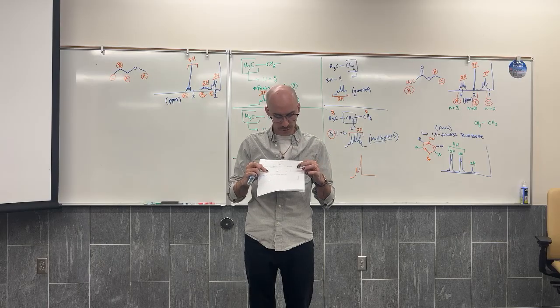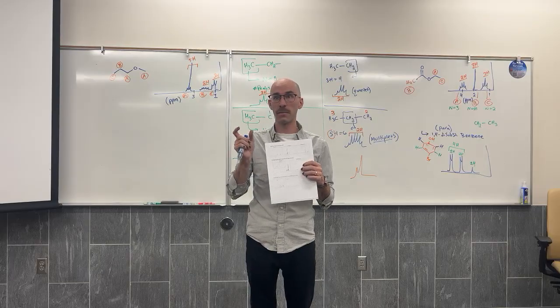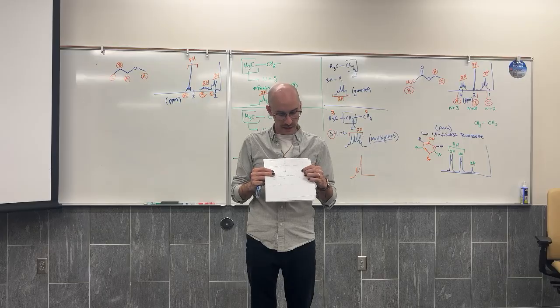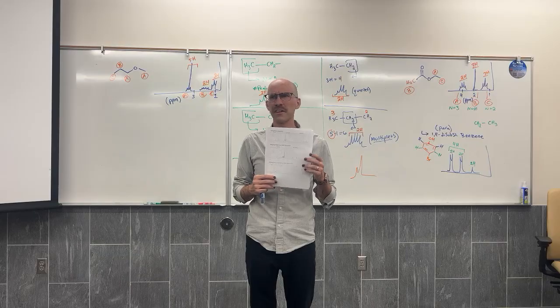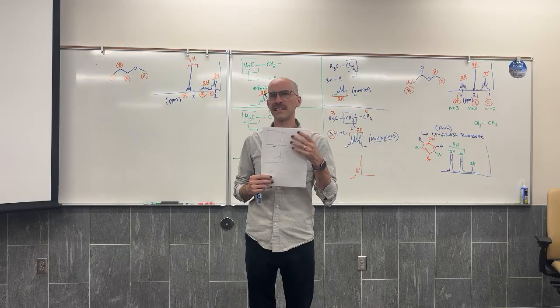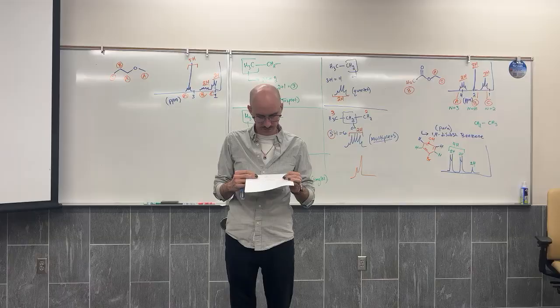Then with our methyl vinyl ether, I can assign the CH3 from the methyl because it shows up as a nice clean singlet. But then all of the other vinylic hydrogens, look at how messy they got. Are those doublets? Why do they look like that? They're so short and wide. It gets complicated. Remember, those vinylic hydrogens don't always behave the way you'd expect.